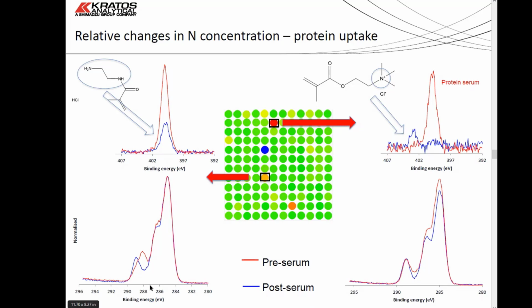And if you look really closely, all of these circles are not quite aligned. That's because it maintains the actual geometry of those samples. You can also export out the table of concentrations as well. But these become huge, and it's only then that you realize how impossible it is to see anything, because you've just got so much data. Especially if you've done fitted models for each of these spectra, it becomes a huge matrix of information, which you can see a lot clearer just in a simple picture.